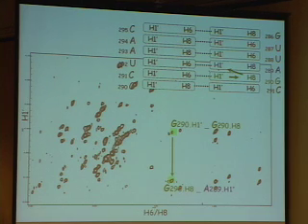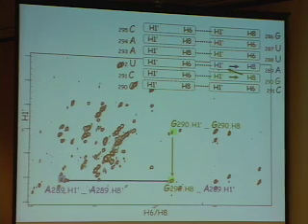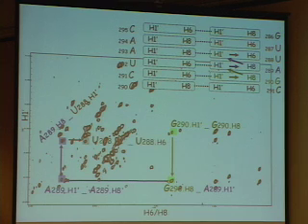And likewise, we know that A289 H1 prime proton frequency occurs here. So from there, we can also make the next jump in our secondary structure in assigning our NOESY spectrum, which would be a straight horizontal step. So it's by this method we can systematically go through and assign all the peaks in our NOESY spectrum.